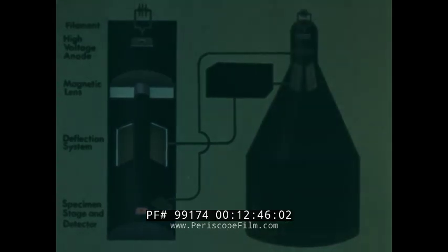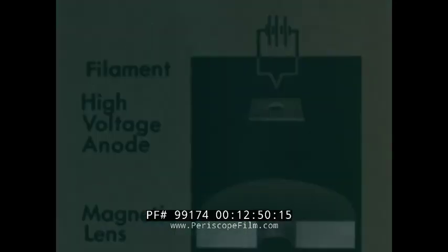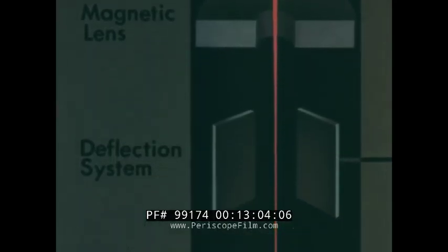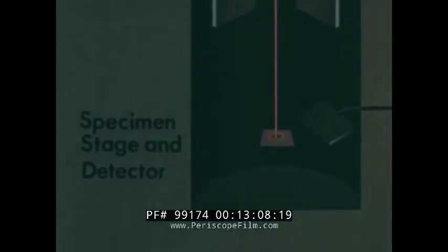Essentially, the scanning electron microscope is composed of two systems: the probing system, into which the specimen is placed, and the imaging system, which displays the visual image. In the probing system, a hot filament generates a stream of electrons. The electrons pass through a hole in the anode as a high-velocity beam and are focused on the specimen as a point, about 1/1,000,000th of an inch in diameter.